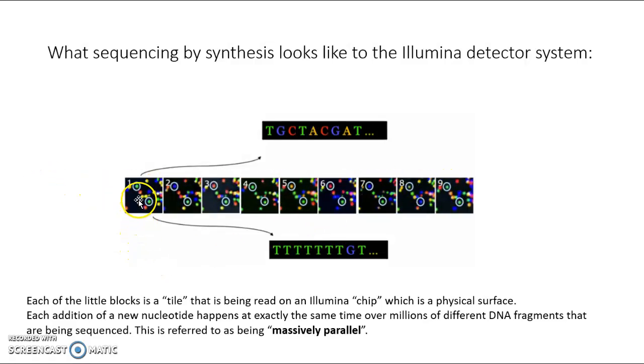And we can see that the first nucleotide was added, and it's giving a green light, and this is T. The next one that's been added is giving a blue light, and that's G. Then a moment later, we see a flash of red light, signifying C. We're back to a flash of green light, signifying T, and so on. Meanwhile, the same synthesis is happening in the clonal clusters at all these other little dots. And we can see that on this bottom dot that's also been circled, we've got kind of a dull sequence. It's not so interesting. We've got a string of T's, and then we've got a guanine, and then another T.